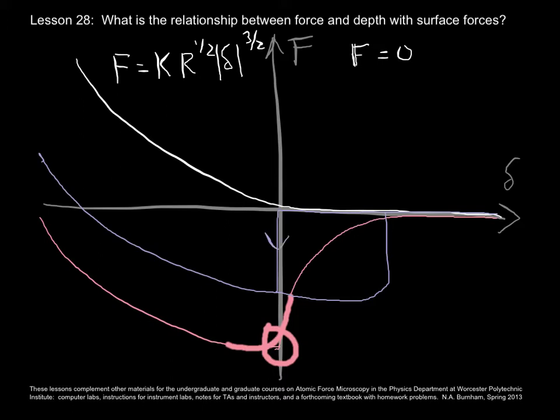So here we have a hysteresis loop due to adhesion of the surfaces of the tip and the sample.